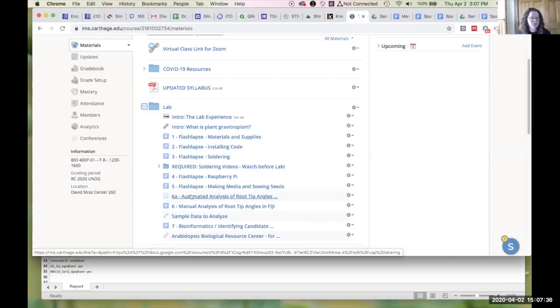Okay. I thought we'd start with the Fiji or ImageJ manual analysis first, and then if we want to get more into image sets, we can move over to Root Trace. I don't know if everyone has a Windows machine at home though. That might be the issue. I don't. I only have a Mac.